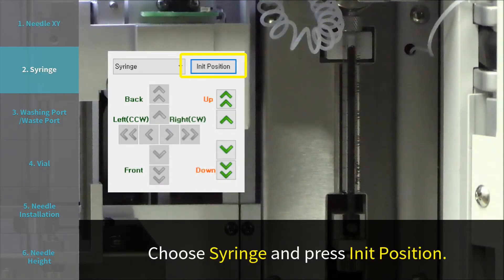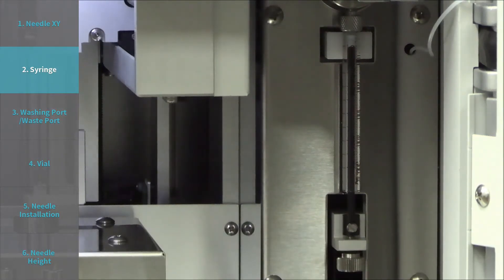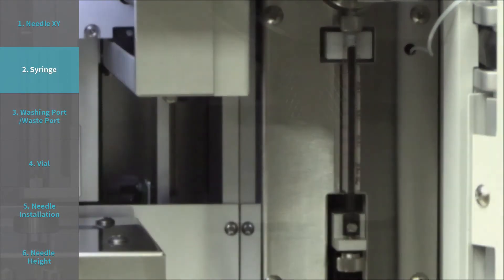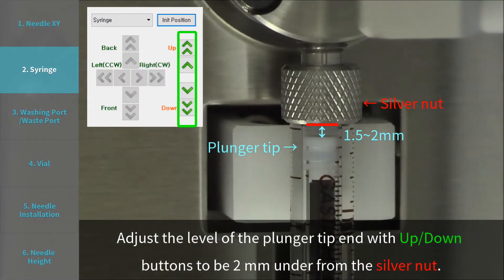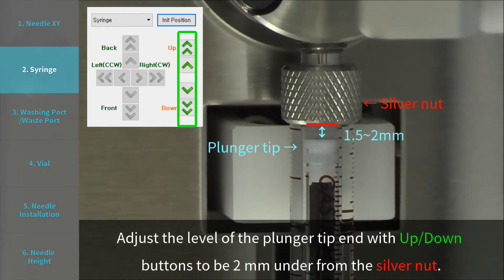Step 2: Syringe. Choose syringe and press INIT position. Adjust the level of the plunger tip end with up and down buttons to be 2 mm under from the silver nut. Press save.